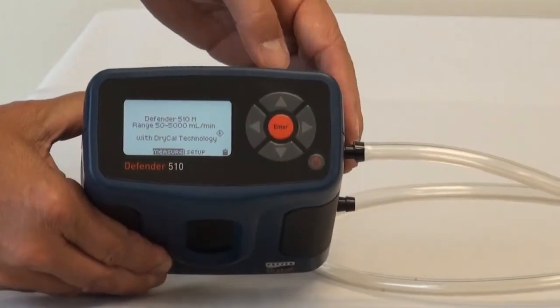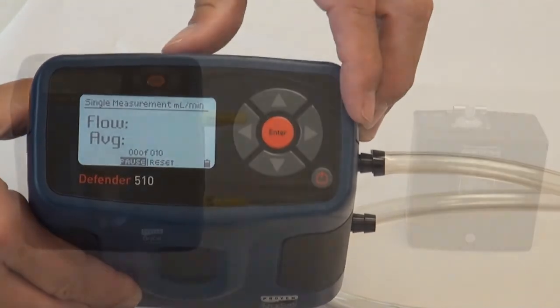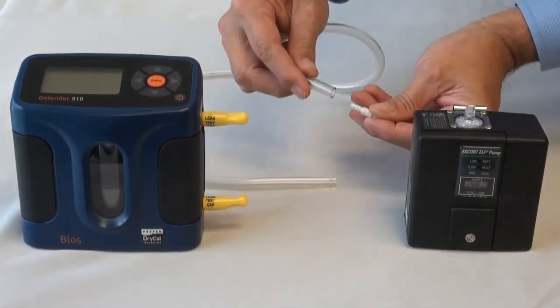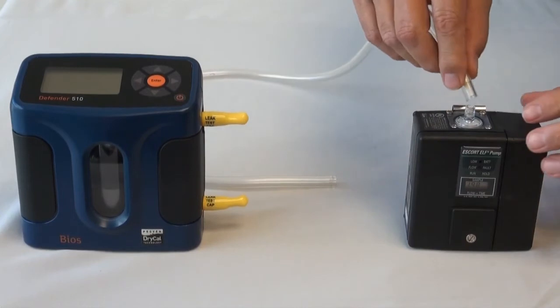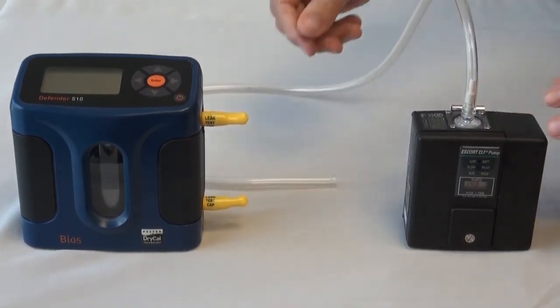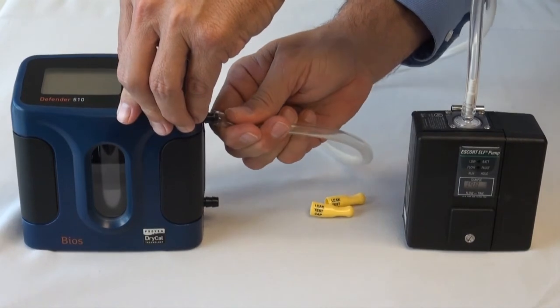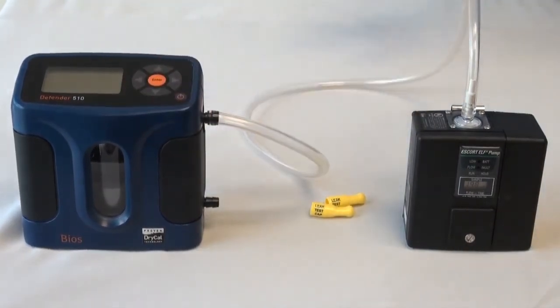If you are using a BIOS DryCal or BIOS Defender as your primary calibrator, it is necessary to use the isolating flow restrictor. This restrictor is provided with each new Escort Elf pump or can be purchased separately. Failure to use the restrictor can result in a calibration inaccuracy. Place the restrictor in line of the sampling hose between the pump and the sampling media. The calibration procedure from this point is the same as with the Zefon DigiCal.